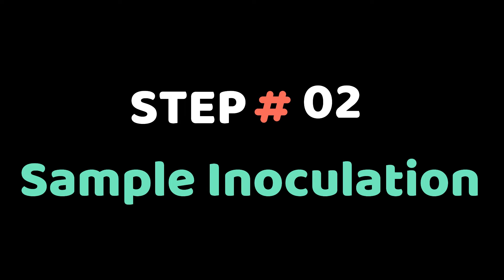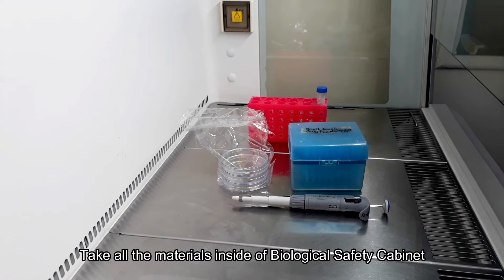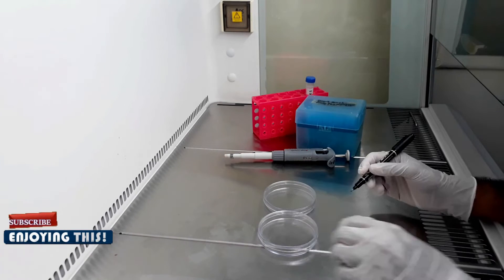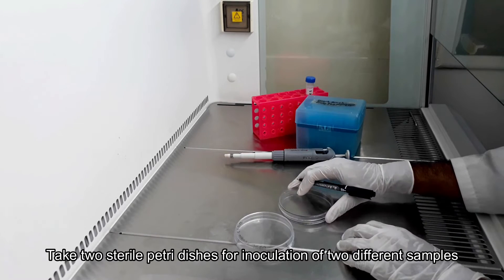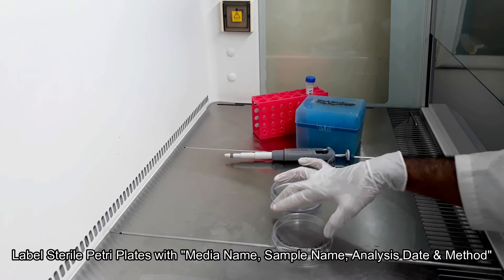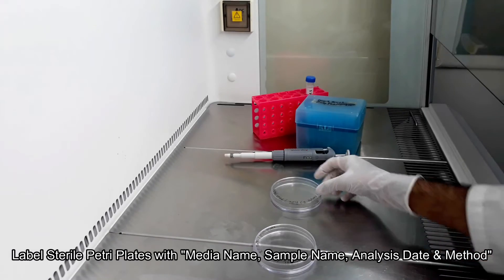Now we are going to the main test for inoculation. Clean your workstation inside the biological safety cabinet. Bring everything needed for the pour plate technique. Label 2 sterile and blank petri dishes for 2 samples. Labeling should be done by media name, test name, method, date, etc.